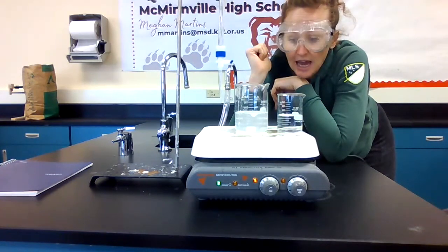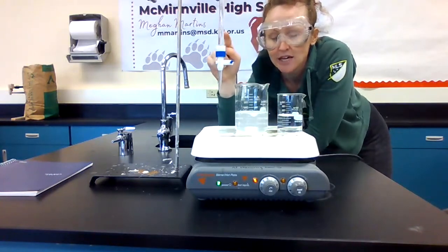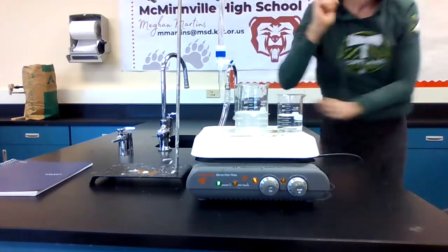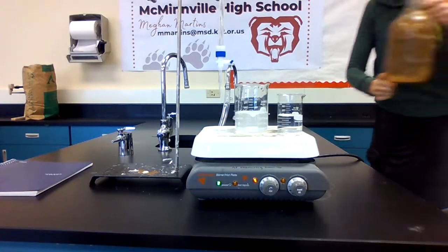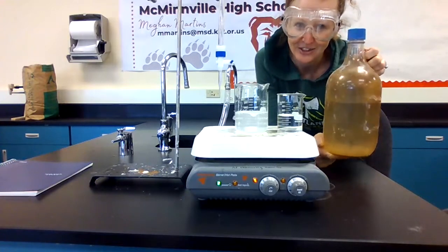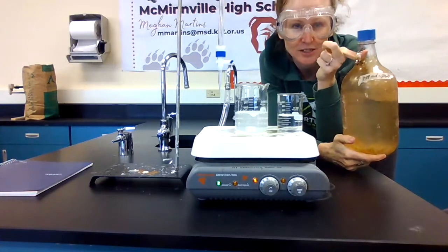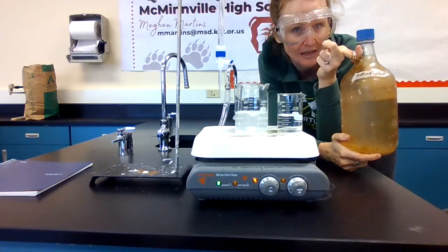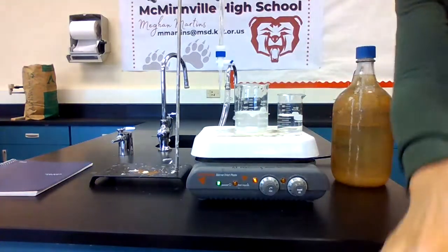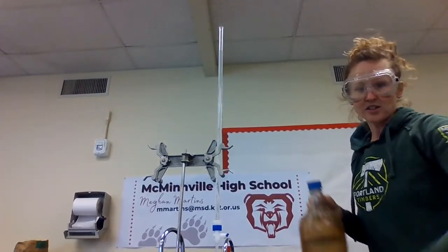So let's take a look at this and see what it looks like. In order to do this, we need to add sodium hydroxide, which is going to be our base, into our burette. Sodium hydroxide comes in this trustworthy little jar. Actually, it does have a label. Notice my super trustworthy looking label: 3 molar sodium hydroxide. So when I need to fill up my burette, am I going to take the top off and pour straight into my burette?